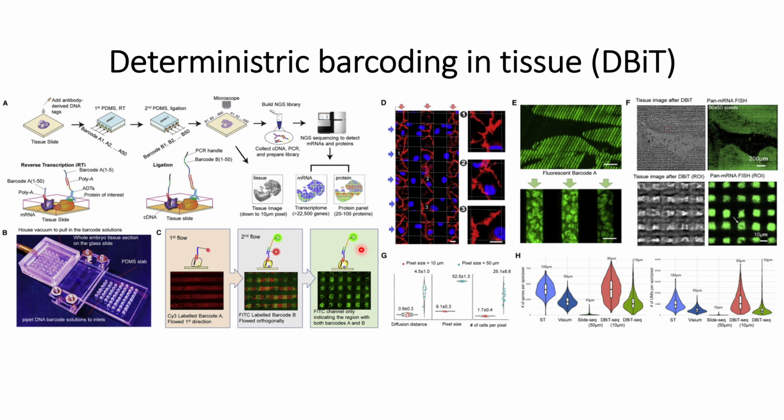After validating these results, they need to check how accurate these models are in actual tissue experiments. For this they use endothelial cells and grow a monolayer of endothelial cells, which can be a better, more realistic model of the tissue. Thereafter, they label the junctions of the endothelial cells and also the DAPI.